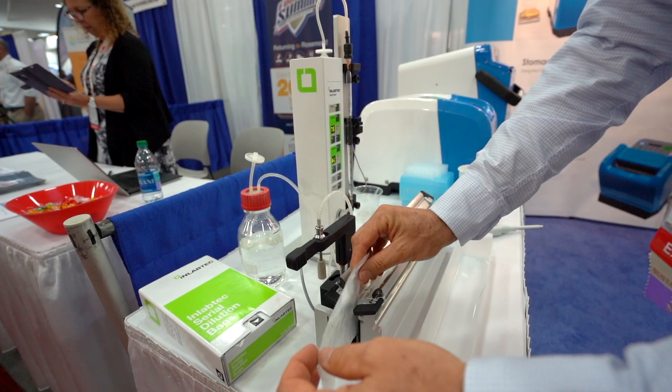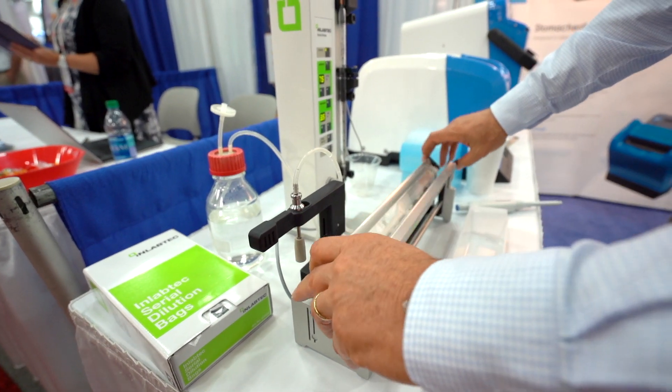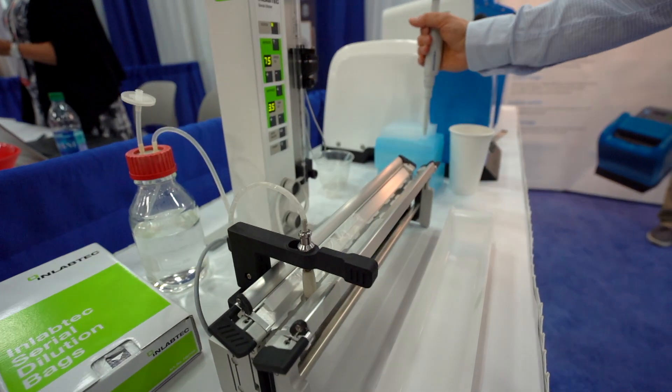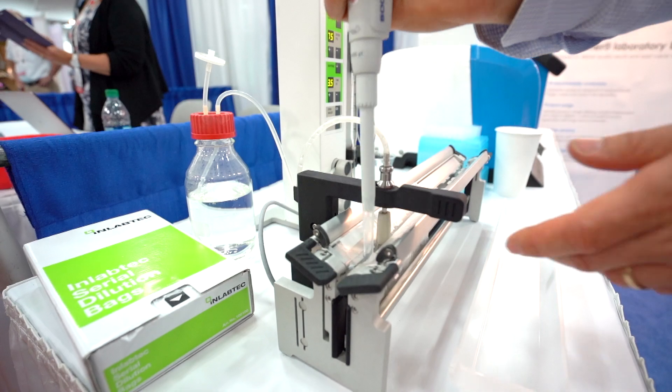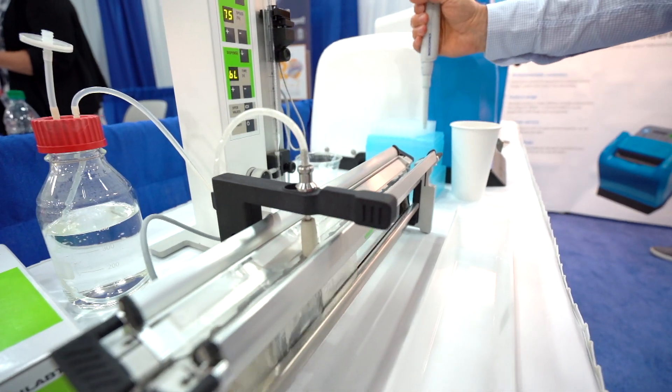We use sterile bags, UV irradiated, and then you can put them in the bag holder and change how much buffer you would like to add for your dilution. You can do 6 bags in under a minute, or with an additional bag holder you can do 12 dilutions.